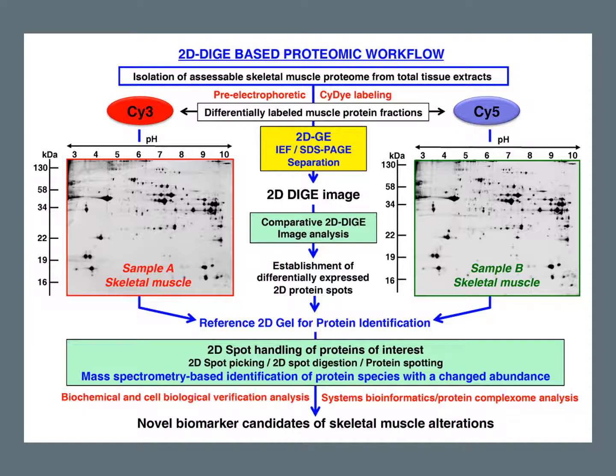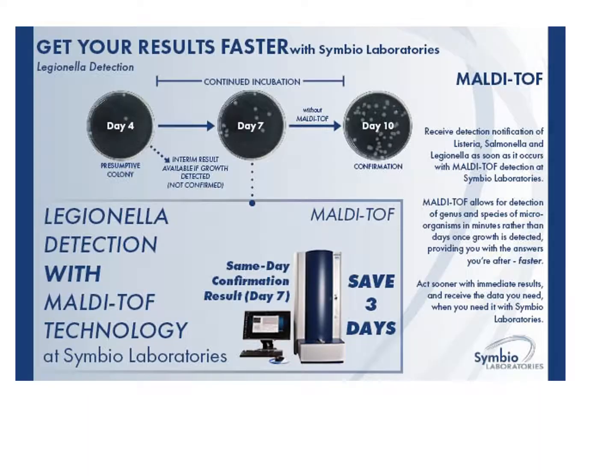Yeah, this one is high. See, that's the black spot, and it's almost nothing here. So we could take those two spots, further digest them, and then do MALDI time of flight or the electrospray, and figure out the mass-to-charge ratios of the fragments there.